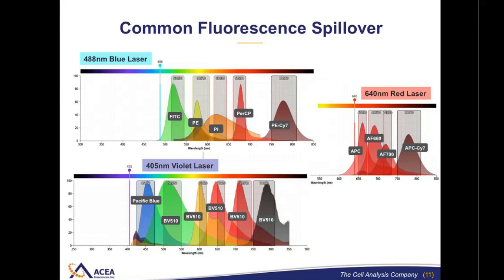In addition, folks sometimes feel that they don't need to worry about spillover in experiments that only use fluorochromes excited by distinct lasers. So this is a great strategy, again, to minimize spillover. However, I would urge you to run the single-stain controls to double-check what's going on for yourself. Cross-laser excitation can occur, and it's important to understand how it might affect your data analysis.